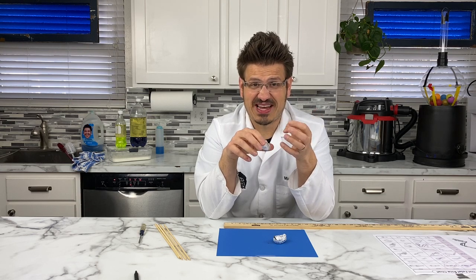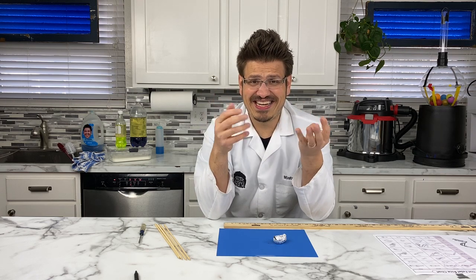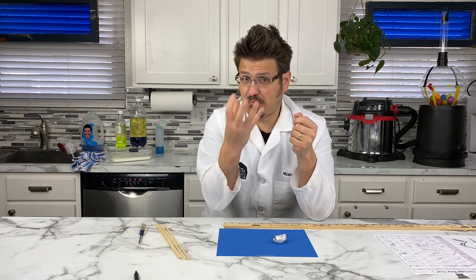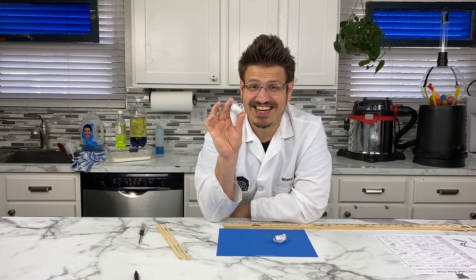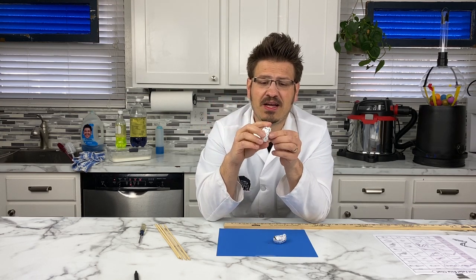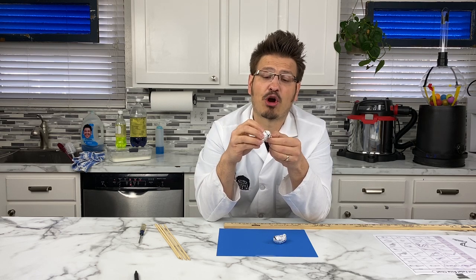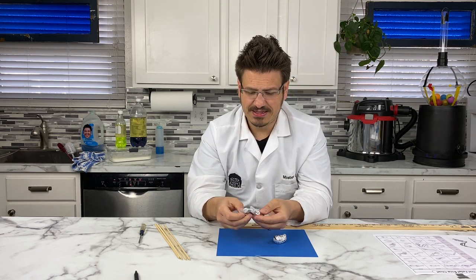So what they do is, after they've eaten, that's in their gizzard, and eventually when they're due to eat again and get more energy, they spit it up, they regurgitate it. And that's what this is. And that's what I'm holding. I'm holding an owl pellet. This is from a barn owl. Barn owl, B-A-R-N. And I'm gonna open it up.